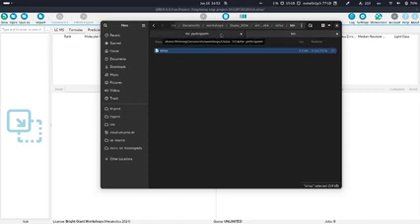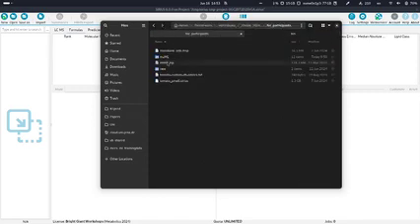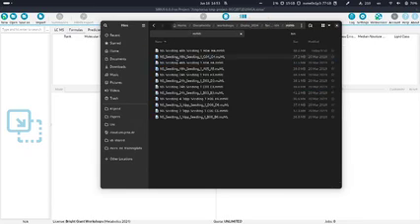In the folder there should be a mzml zip file. If you have extracted it, you will have a folder, mzml, and it will contain some mzml files. First we will just load some of these files. Sometimes it takes a little long, so let's just load like 4 files.